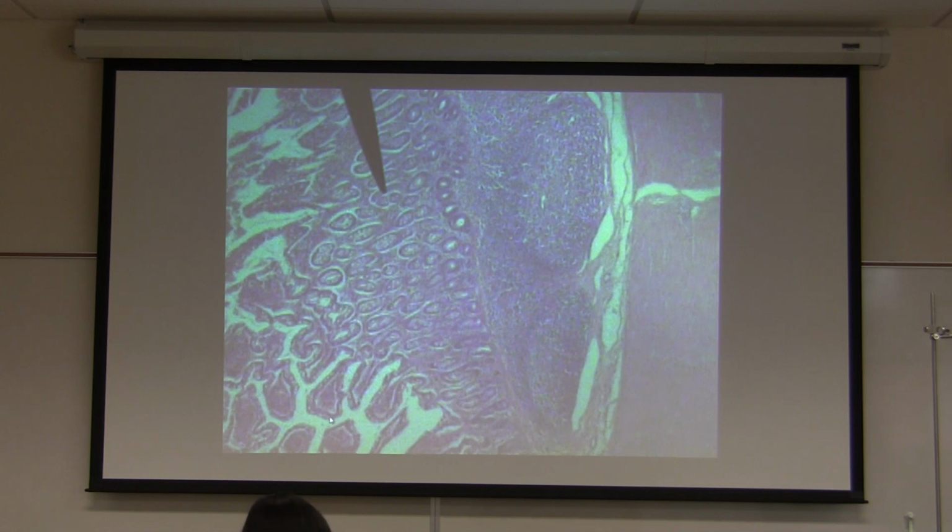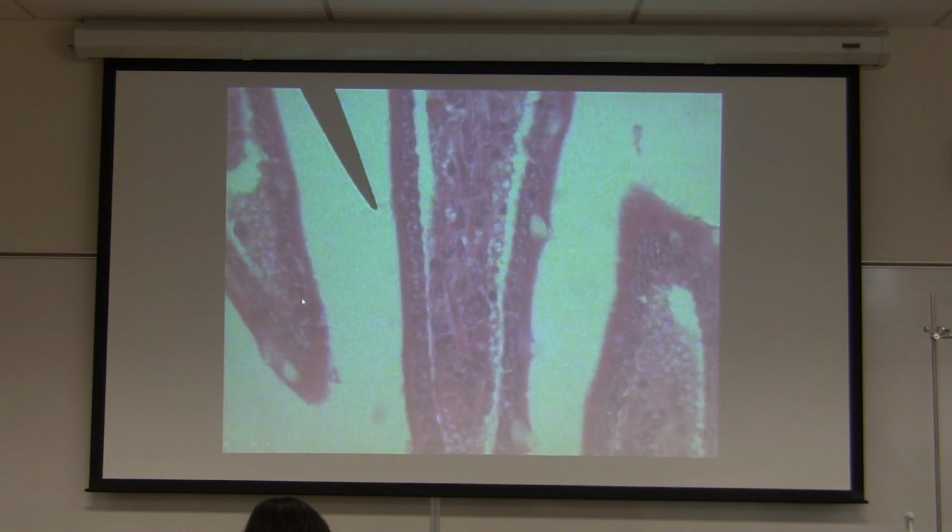What tissue? Simple columnar epithelial tissue. And this is all lumen of the intestine. These are all lumen of the intestine. I hope I'm clear as mud. Okay, what is the name of tissue? Simple columnar epithelial tissue. What is the name of cell? Goblet cell. What is the name of structure? Villus. I might show it to you at this magnification. You don't have to see the whole entire small intestine to call this small intestine. At this magnification, this is the only thing you have that looks like this.